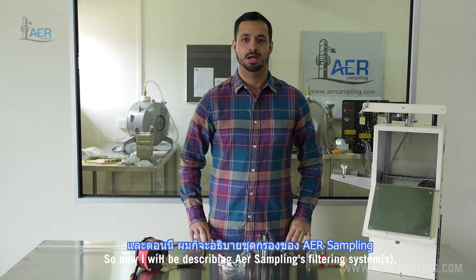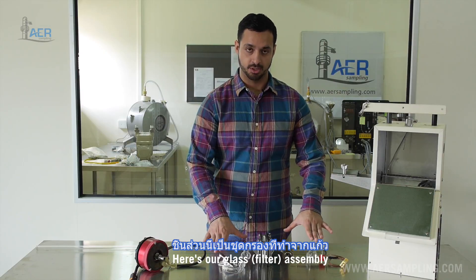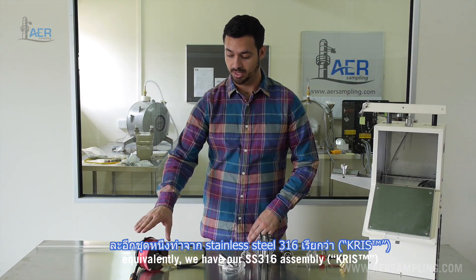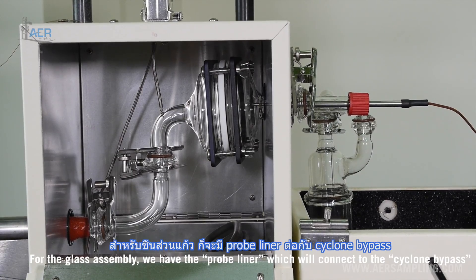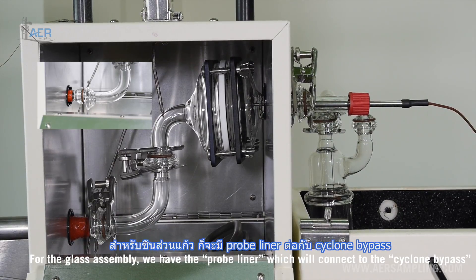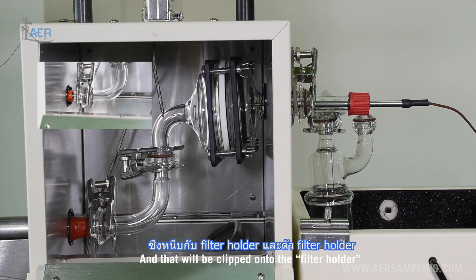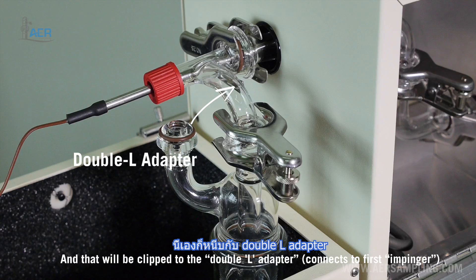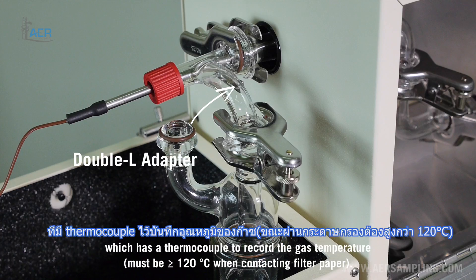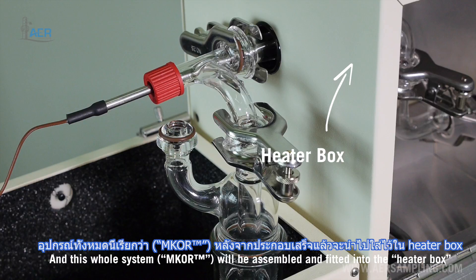Now I will be describing AER Sampling's filtering system. Here's our glass assembly; equivalently we have a stainless steel 316 assembly. For the glass assembly we have the probe liner which will connect to the cyclone bypass, and that'll be clipped onto the filter holder and then clipped to the double L adapter, which has a thermocouple to record the gas temperature. This whole system will be assembled and fitted into the heater box.